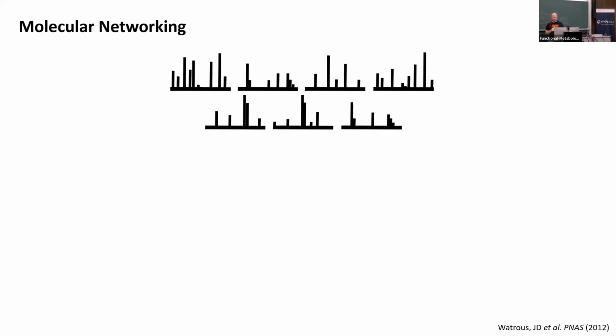It's fascinating to work with the people in San Diego who actually developed this, and this is molecular networking. If you have not heard about it, it's a relatively simple concept that has been applied before to peptide MSMS spectra. But I think metabolomics, especially the search for new metabolites and natural product research, is where it's particularly useful.